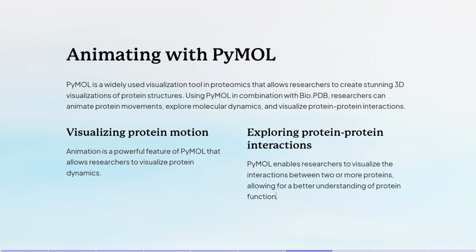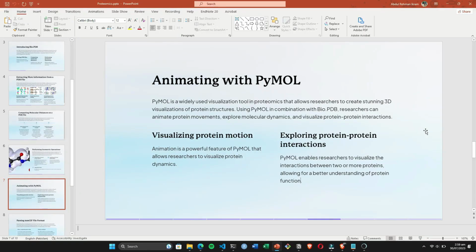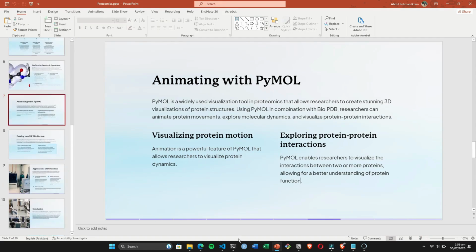But you can also use this to visually see how a ligand is being attached to your protein. For example, a protein ligand interaction can be stunningly studied by using the animation protocol by Pymol. So, let's just do that.